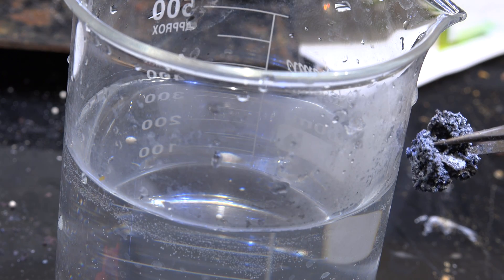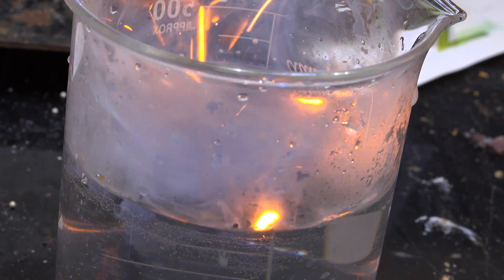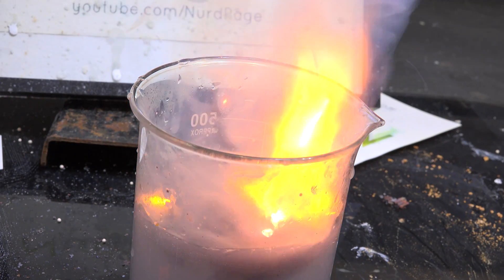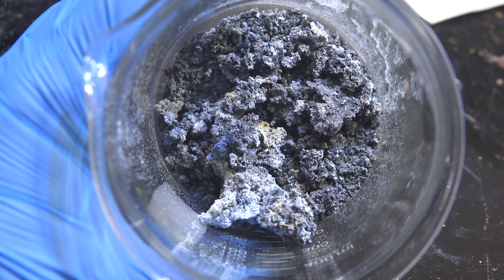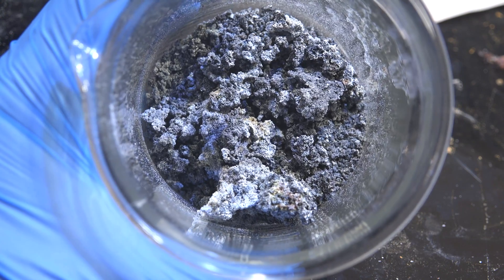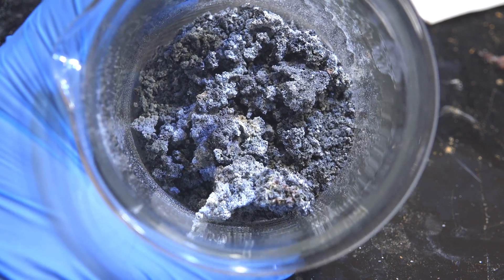I have some water here and here is a chunk of the aggregate. Whoa. Let's try that again. And there we go. It's almost like sodium in its reactivity. And in fact it's actually slowly being oxidized by air as it sits.